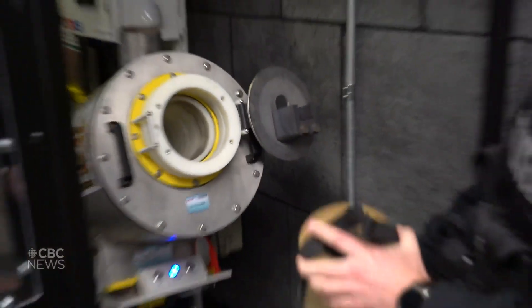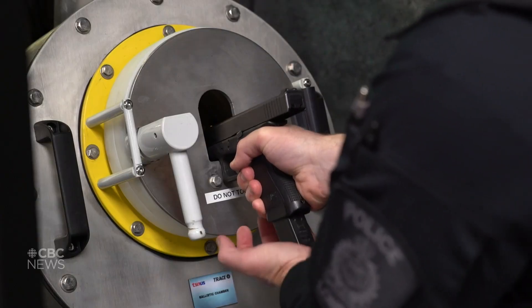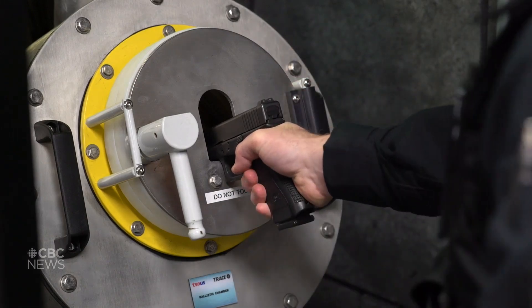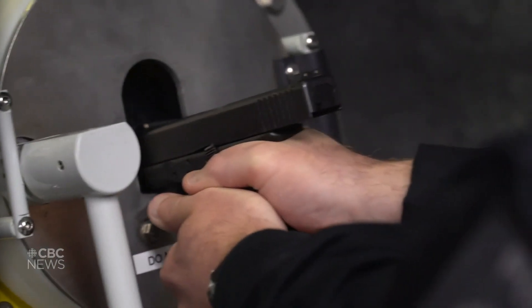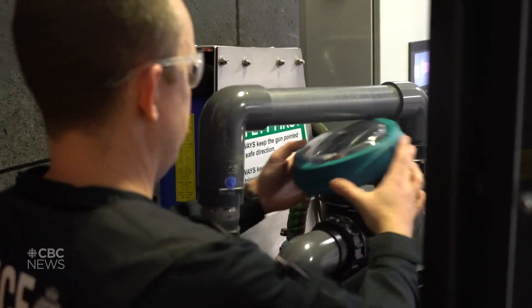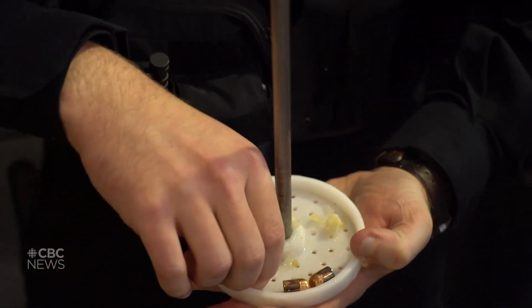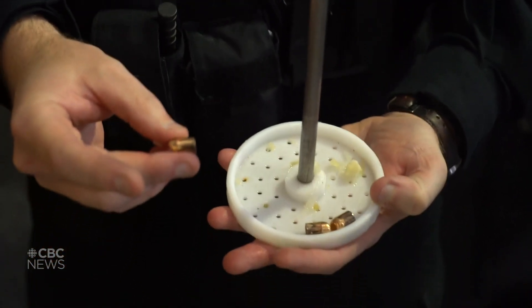The water comes up to right at the end of the plastic here, and there's a pump that's running. As soon as I shoot the rounds into it, those projectiles get deposited into the top of the filtering system. I'll retrieve our projectiles from the pump here in the back. Those are three pristine projectiles that were slowed down by the water tank that the CFS can use to upload the fingerprint of this firearm to the database.